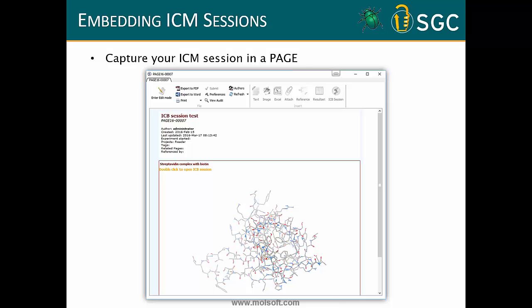The other question was, maybe I should answer, is this a module of ICM or is it standalone software? It's definitely both. Can be standalone, or you can import it into your current ICM. Yeah, absolutely. I won't show it today, but you can run the normal ICM Pro session, for example, and you can just connect to Scarab directly from within there, and you can use Scarab at the same time as using ICM Pro in the same program. You don't have to fire up another version of ICM Pro for that.